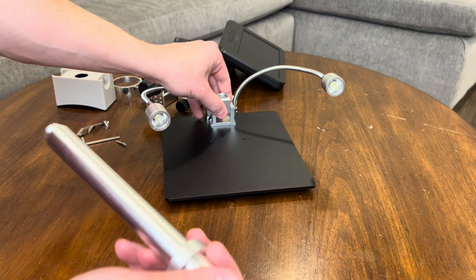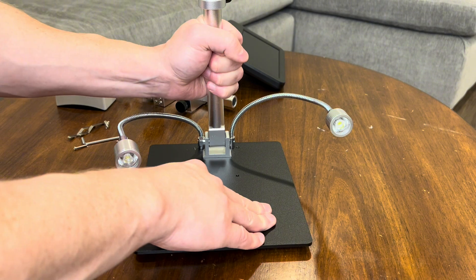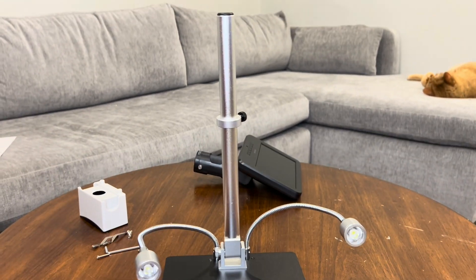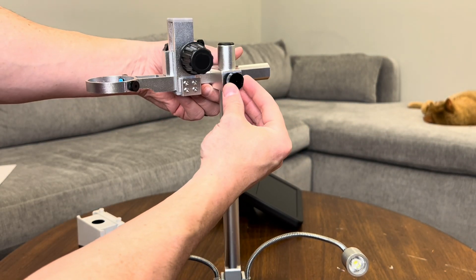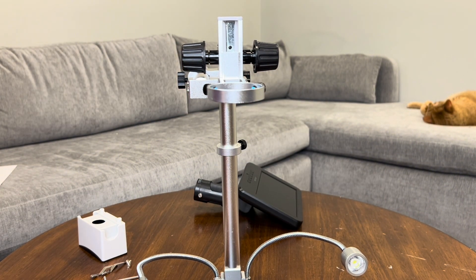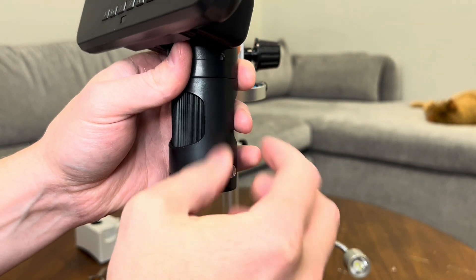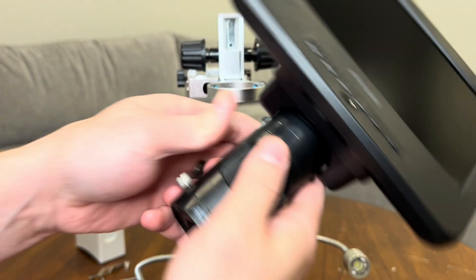Now that we've got everything unboxed, let's move on to setting up the microscope and going over its key features. One thing I really appreciate is how simple and quick it is to get this microscope up and running. First, we'll attach the microscope to the adjustable stand. The stand is solid and gives you plenty of flexibility to raise or lower the microscope to your preferred height and angle, which is great for different viewing purposes, whether you're examining a flat sample or something 3D like electronics.